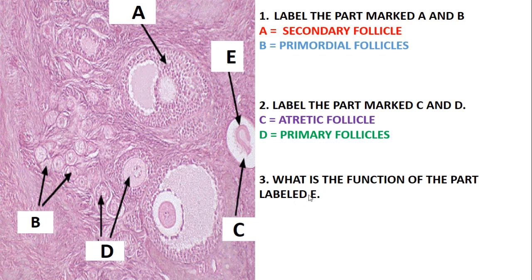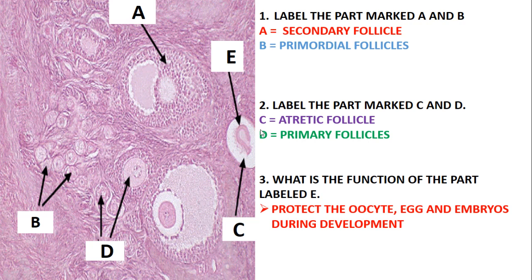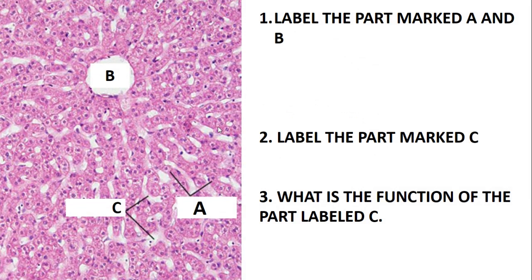What is the function of the part labeled E? This part is just the zona pellucida. It functions to protect the oocyte, egg, and embryo during development. It also regulates the interaction between the ovulated egg and sperm during and after fertilization. The zona pellucida protects the oocyte and controls the process of fertilization.